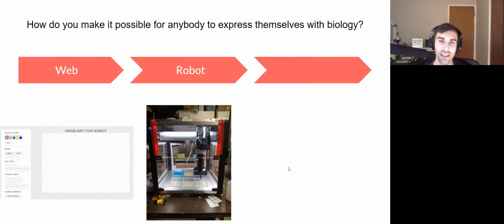So this is a before and after. Originally I had a pretty inefficient protocol written, and you can watch it print here. It puts it in, waits for a little while, moves, does another one, and then I figured out how to make it a lot more efficient by just changing the kinds of instructions. And so you can see here, it moves much, much faster, and it's a little closer to a sewing machine, which I really like when you can just watch it go.